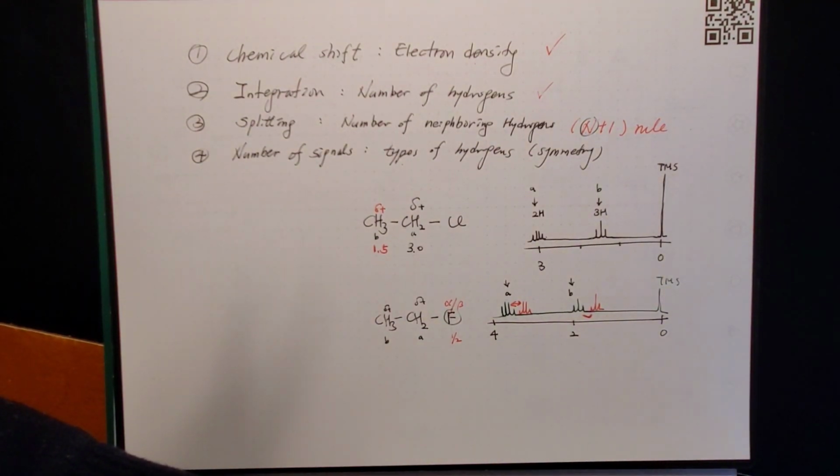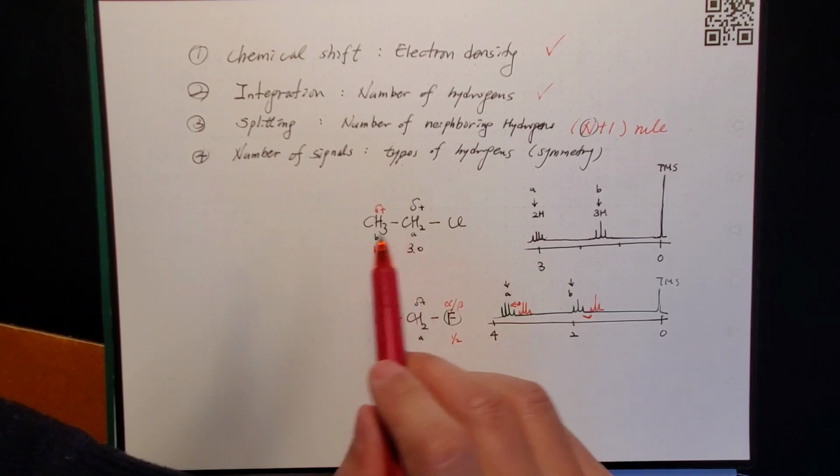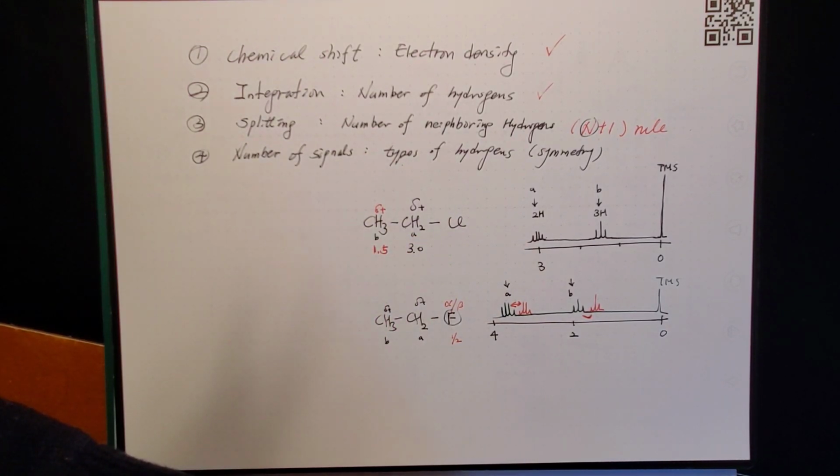Another thing for the majors, the halogens, those electronegative atoms as well, their influence on the alpha and influence on the beta, they're not always going by the order of the electronegativity. Yes, oxygen influences alpha very strongly, but it doesn't influence beta as much as chlorine does.